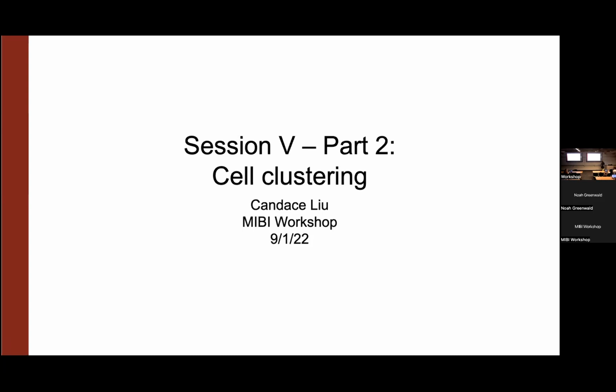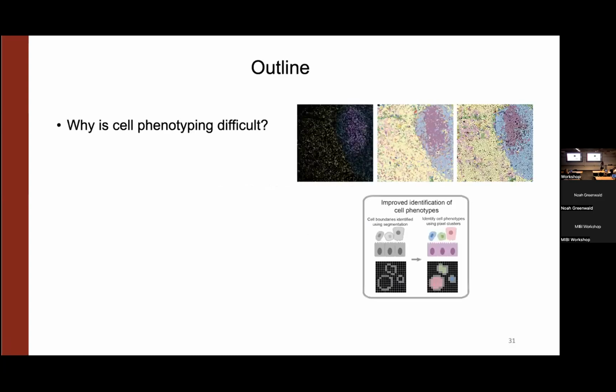All right. Hi, everyone. So in this next session, I will be talking about cell clustering and how we go from segmentation labels to actual cell phenotypes. Okay, so first I want to talk about why cell phenotyping is so difficult.